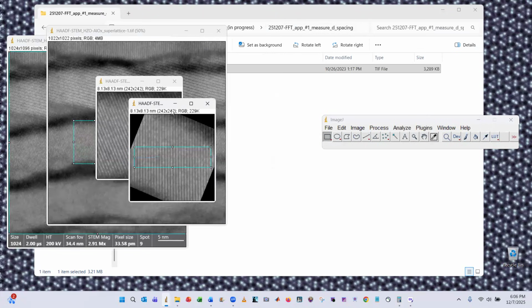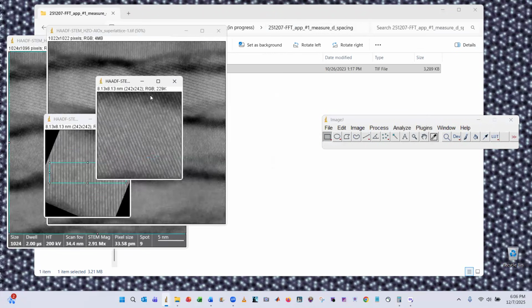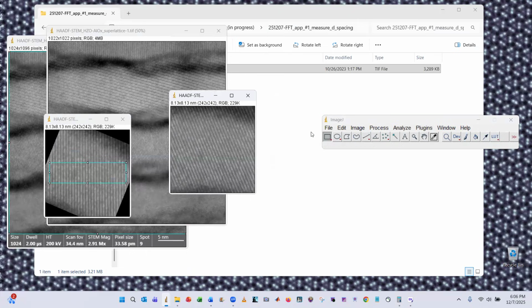So now, what if instead, right, we have this image here. Let's just compute the FFT.